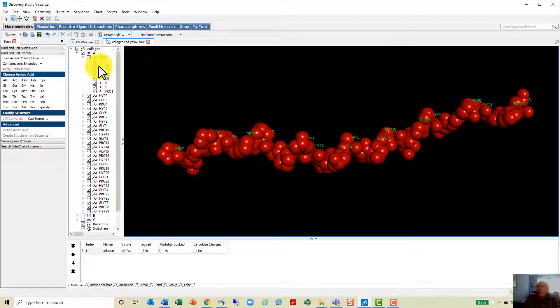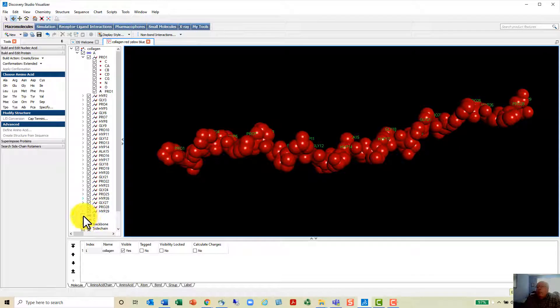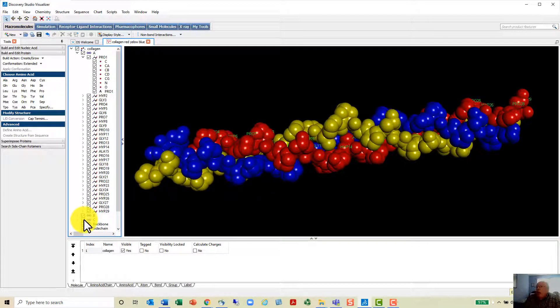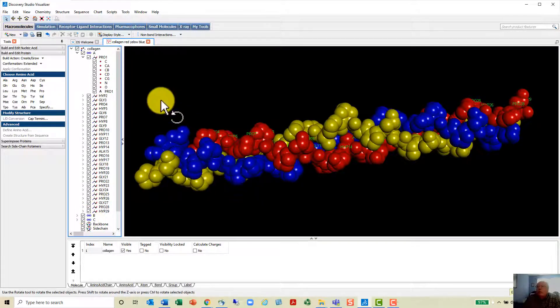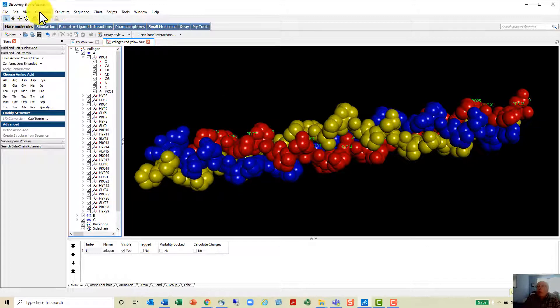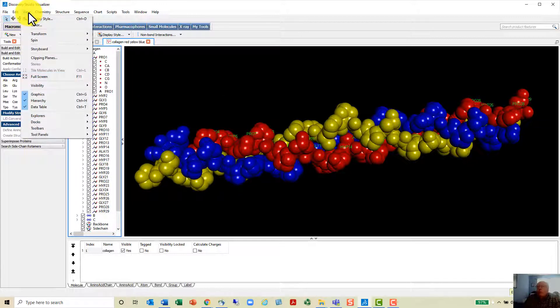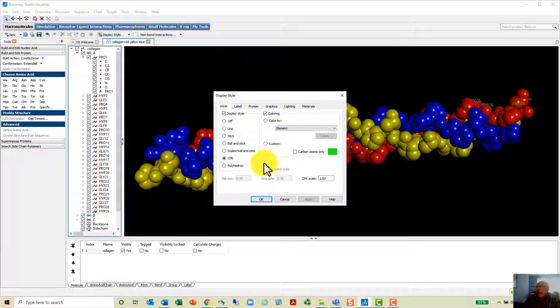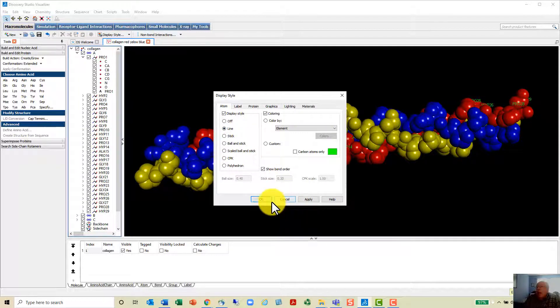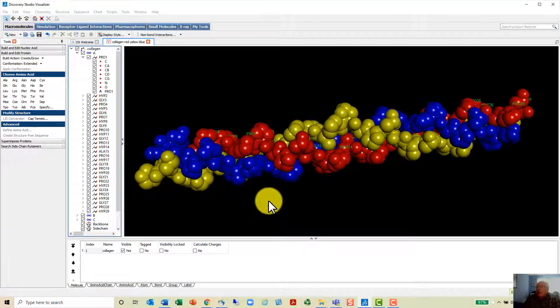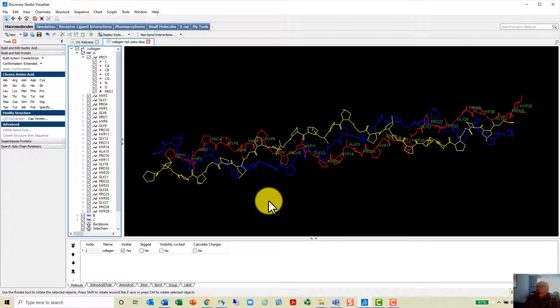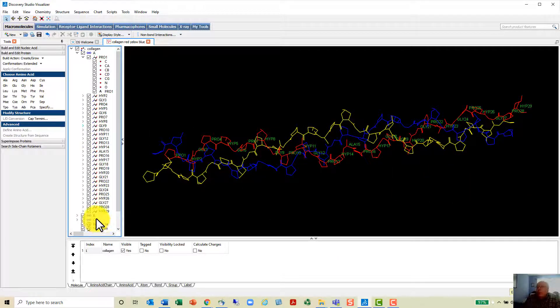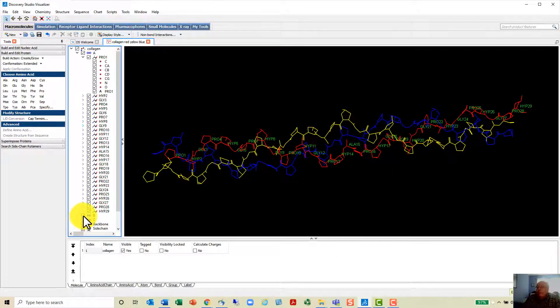Neat little tool to use, and then you can pull back in the other two and have the nice 3D structure. You can also change the view. You can go to display and instead of having CPK which is space filling, you can go to line. In the line you can see there, and you see I've got them labeled and you can turn off B and C.